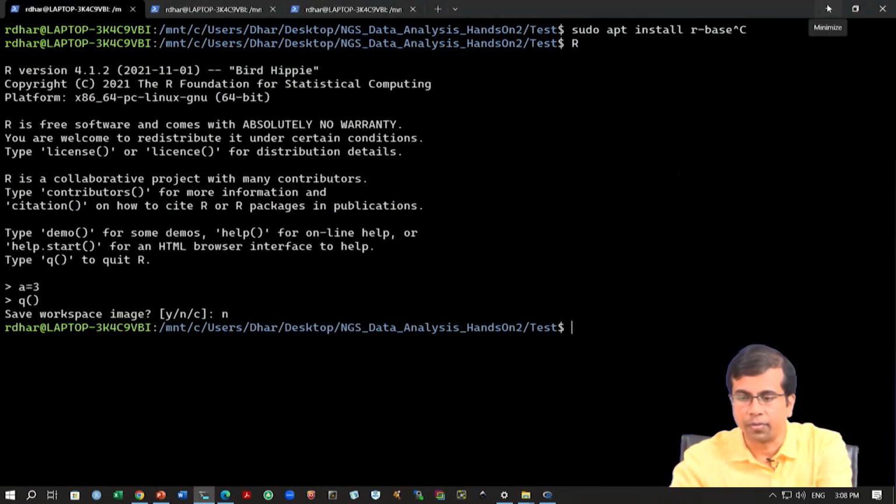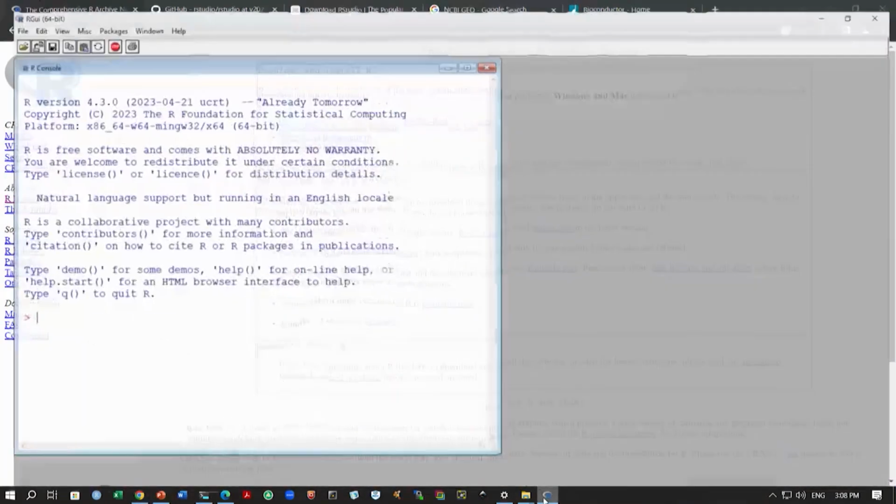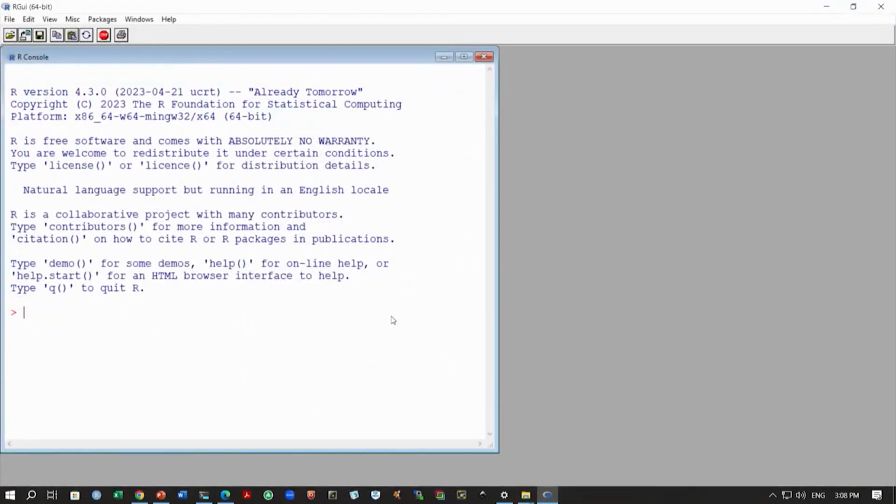All right. So, now going back to R here. R can support a lot of different data types. You can have lists, you can have vectors, you can have matrices. So, different types of data can be used in R. To create a vector, you can simply assign a vector. Let us say we have a variable named vector.